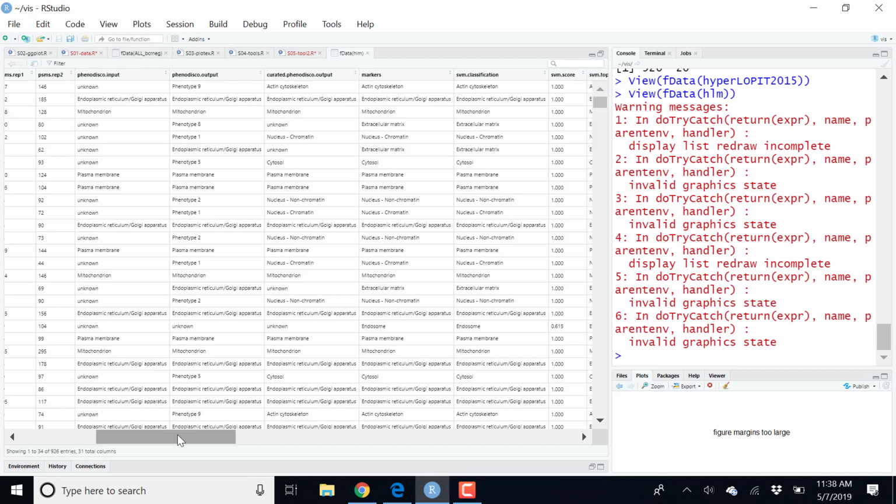But very often, when we do this, we get these trees that don't mean anything. I mean, they're just too big, too many features. So before doing this, we're going to transform, to process our data. And really what we are interested in here is to do a hierarchical tree, not of all the proteins, but of all the proteins that belong to the endosome, all the proteins that belong to the plasma membrane, those that belong to the mitochondria.